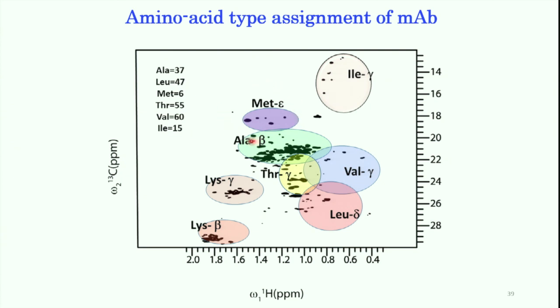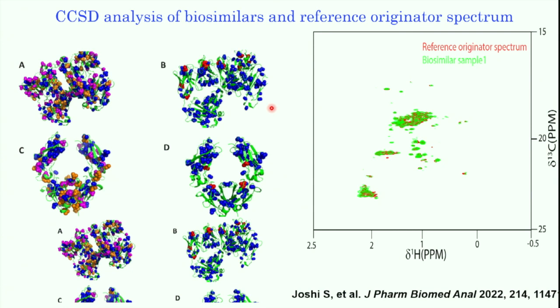But you see where this information can be used. Methionine oxidation is one of the critical considerations in biopharmaceuticals. So if any shift in these peaks happens, you know that methionine is getting oxidized, right. So one can record the NMR spectrum of, say, the oxidized product versus the normal product, and you see the shifting of this peak can show the variation in a biosimilar product.